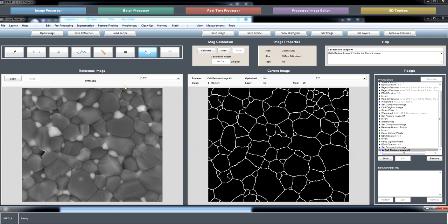Okay, so is there anyone left? I don't want to completely avoid 3D since that's another one of MIPAR's capabilities. Ken, are you still with us? Would you like to see a run through of a quick 3D workflow? Sure. Maybe a quick stack of them. Yeah. Sure. Okay.